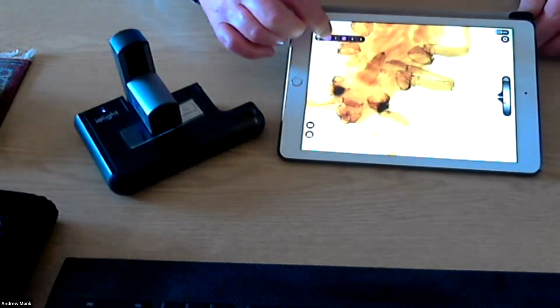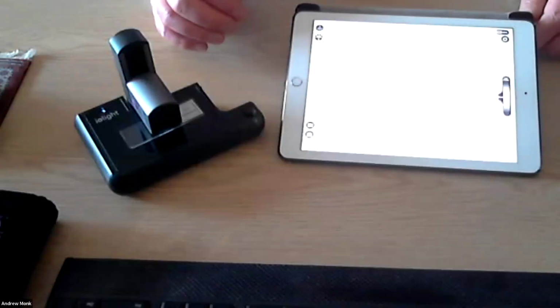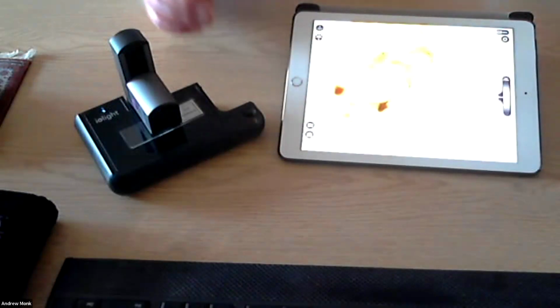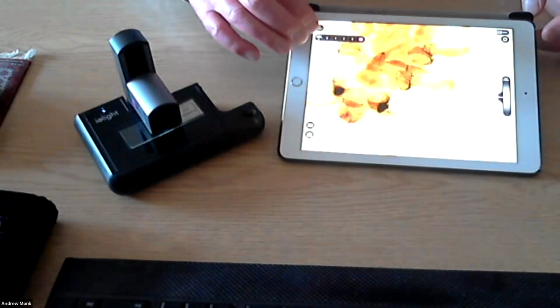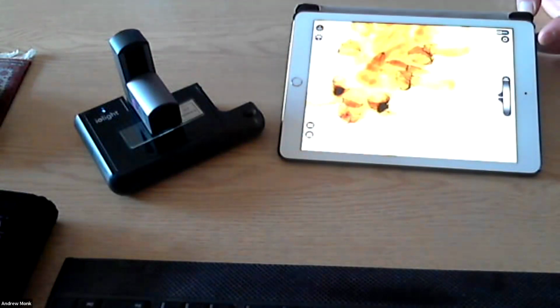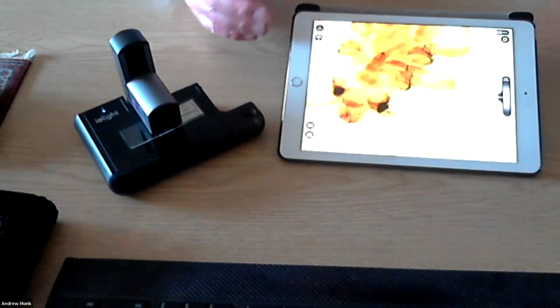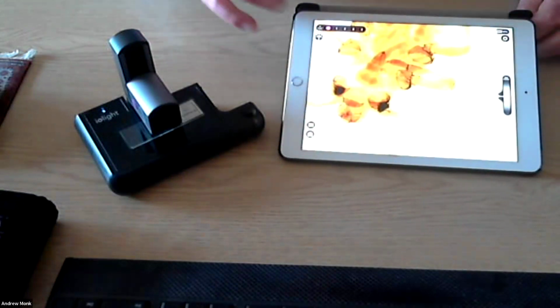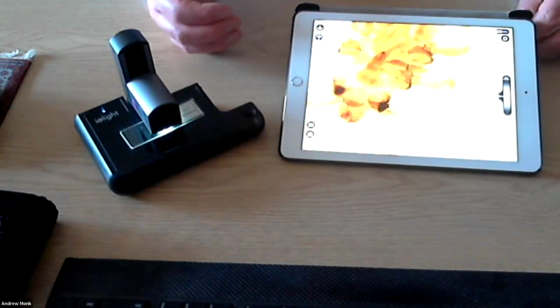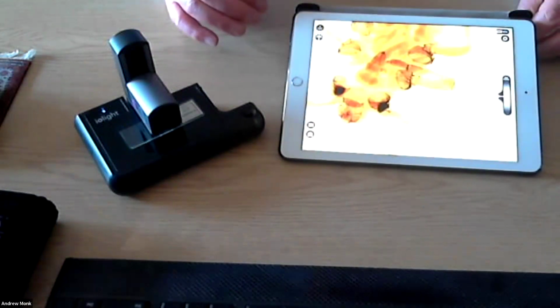And we have control over the illuminator here. I can turn the illuminator off. I think you know what's going to happen. And we can turn it on to super bright. It just changes the contrast a little bit because the camera will shut down. And that's just a slightly more washed out image than the one I was looking at. Yeah, it's slightly better contrast here. We've also got an illuminator at the top above the sample, which we can turn on. It's not going to make this image look any better, but for some samples, like for example insects, it's a real help, that top illuminator.